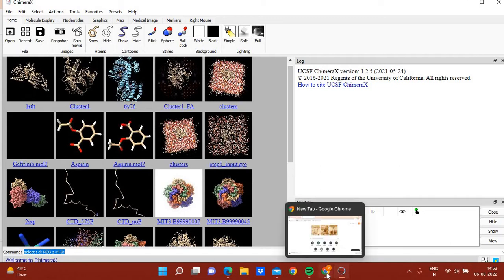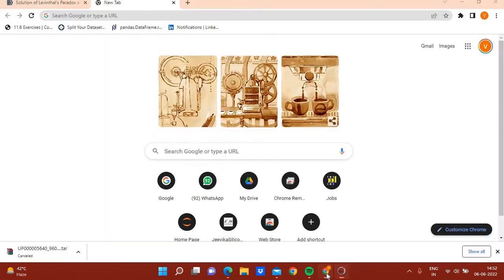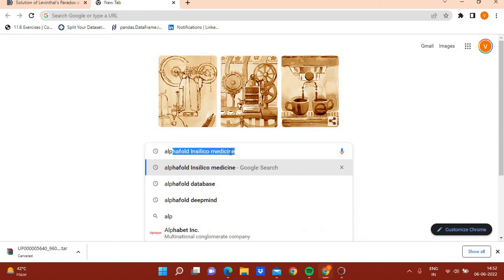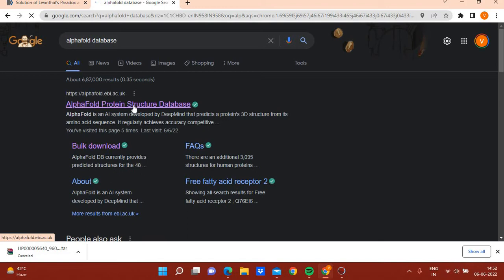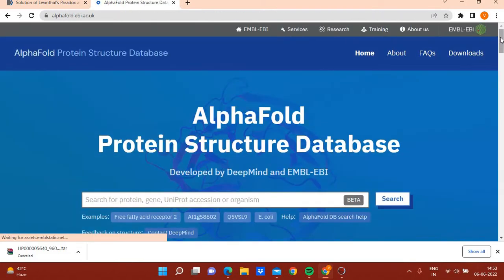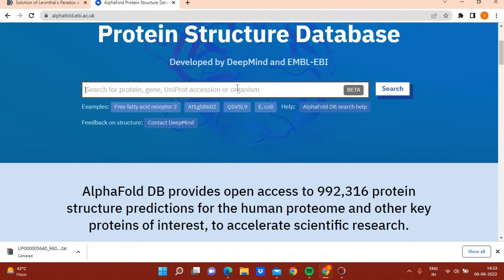Let's explore the AlphaFold protein structure database. If you type 'AlphaFold database,' here is the AlphaFold protein structure database. AlphaFold has predicted structures of all human proteins, so you will find the structure of any human protein here in this database.